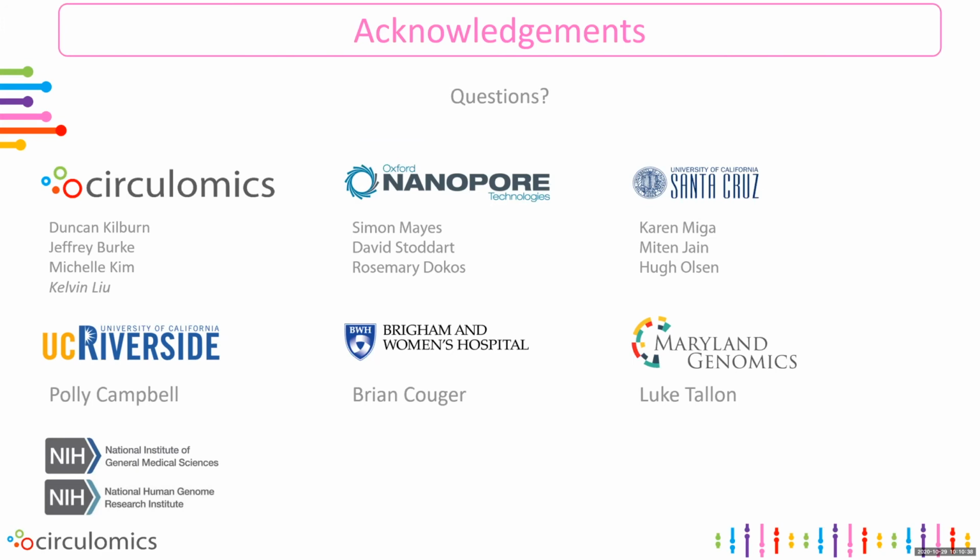Yeah, so we're in the early phases of developing a metagenomic kit. One of the challenges with that kit is always bias and representation: how to maintain a uniform representation across things that are tough to lyse versus easy to lyse, and then balancing that with getting nice high quality DNA out of it. Hopefully, we'll have something available for testing in 2021, but we don't have a hard date identified for that yet.